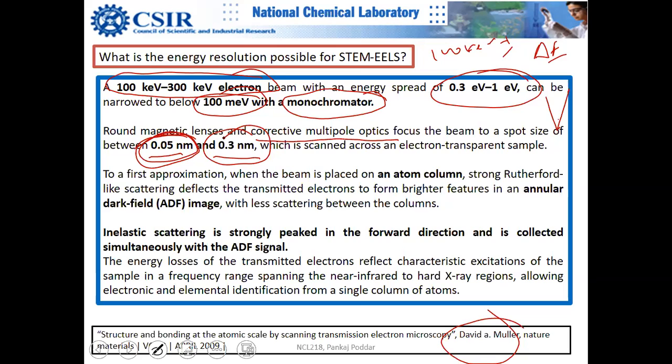Half an angstrom. It's not a joke. So you can narrow down the beam to that level. You need beautiful lenses. Magnetic lenses have to have very good control. Your beam is not moving by even the diameter of a hydrogen atom. It's not a joke. Such precise control.